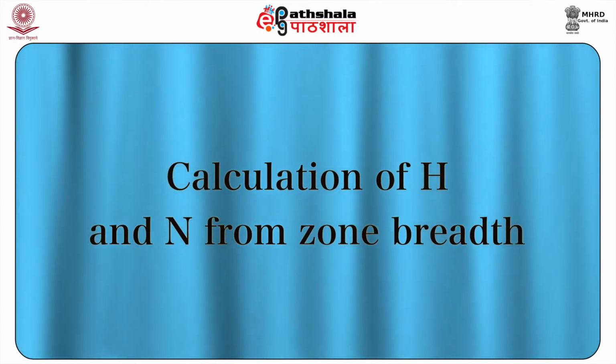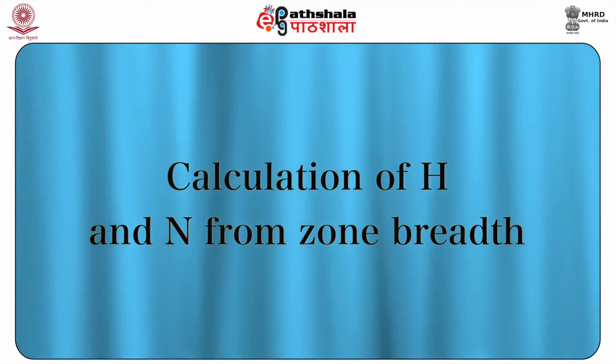Calculation of H and N from zone breadth. The broadening of a chromatographic zone is conveniently expressed as the square of the standard deviation, the variance per unit length of column, from which plate height and number of plates can be calculated.